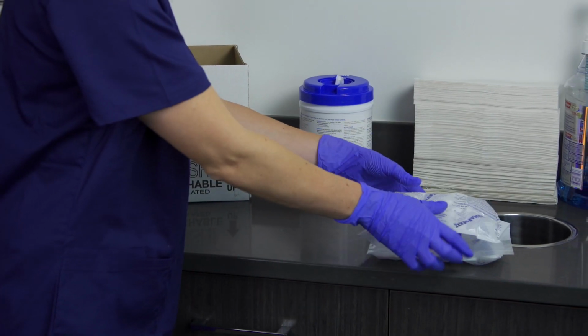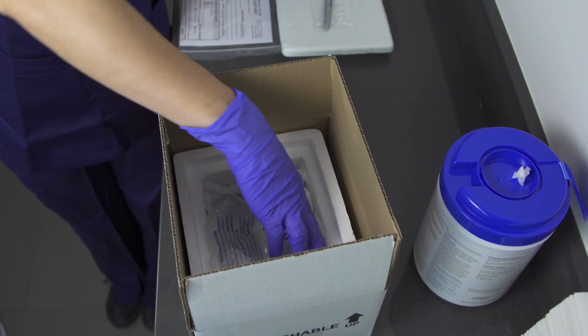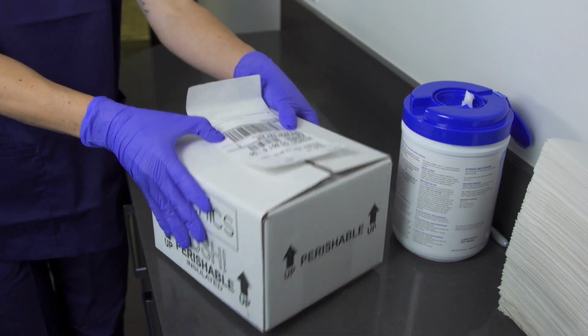Wrap samples in the cold ice packs and place the wrapped vials in the insulated mailer along with the chain of custody. Close and seal the insulated mailer and ship using an overnight return label. If the pickup for shipping exceeds 1 hour, keep the sample collection package refrigerated. Sounds simple enough. Order, collect, return, test.